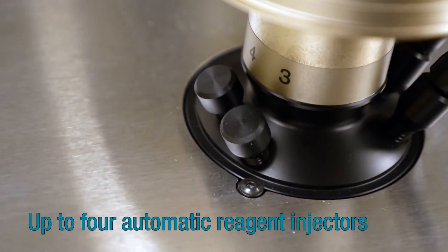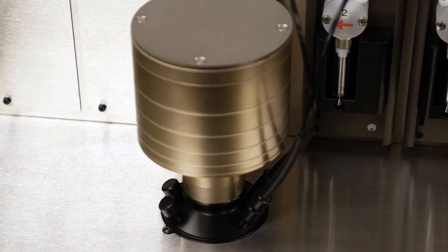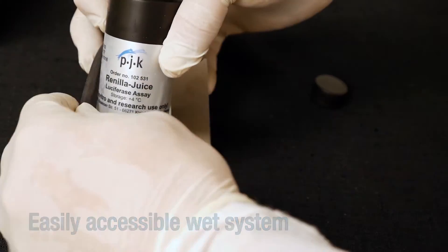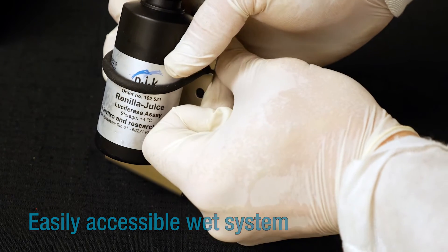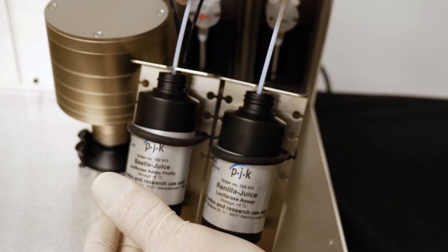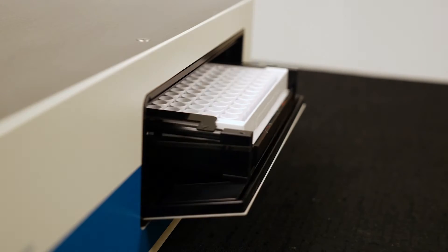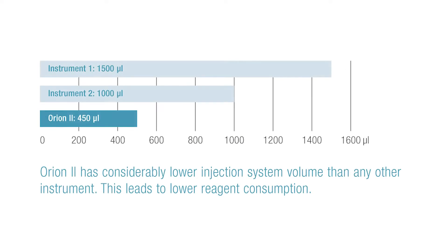Orion II can be upgraded with up to four automatic reagent injectors from 10 to 150 microliters. The wet system is easily accessible and reagents can be connected easily. Lowest dead volume of 450 microliters saves reagent consumption.